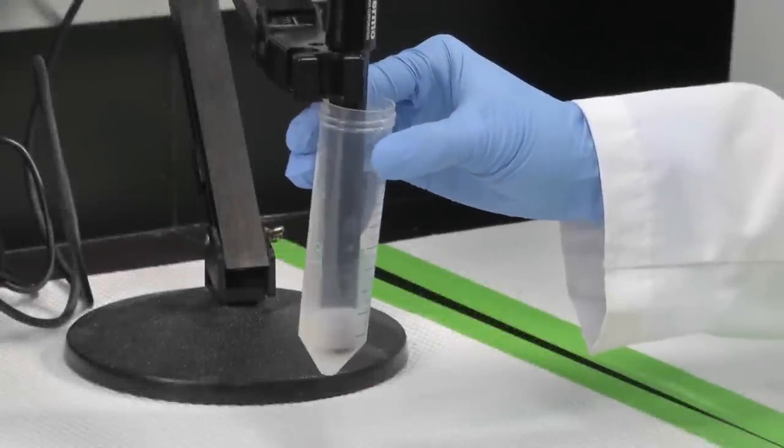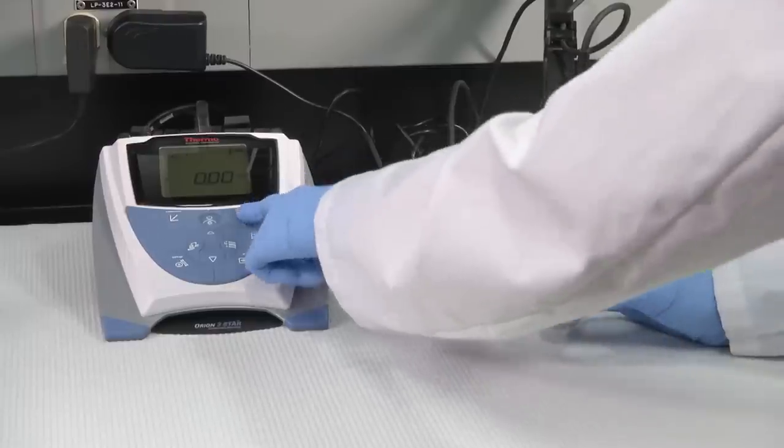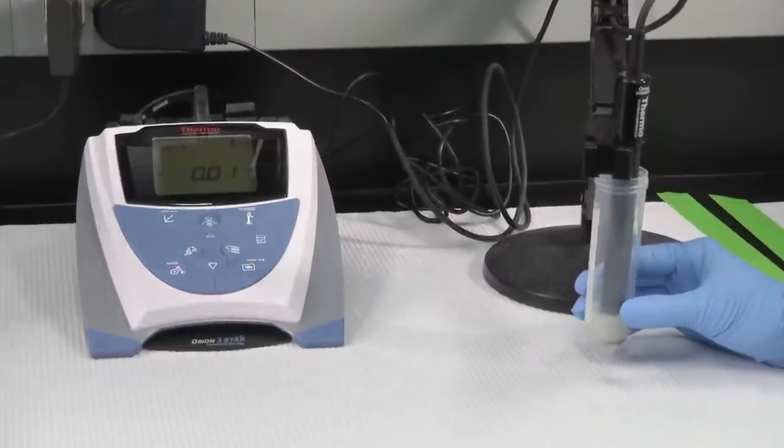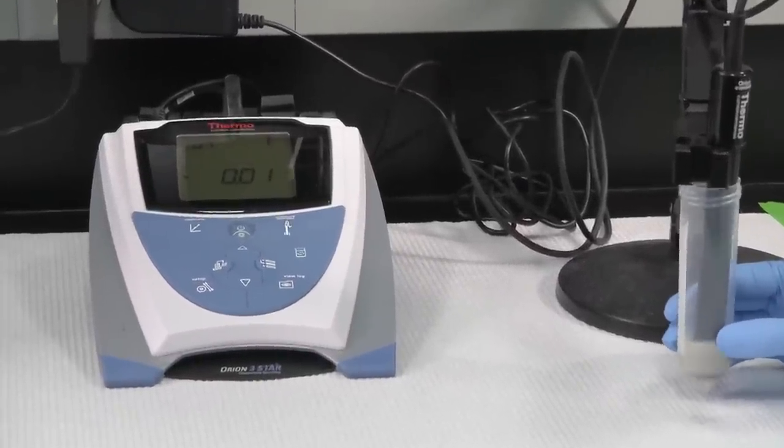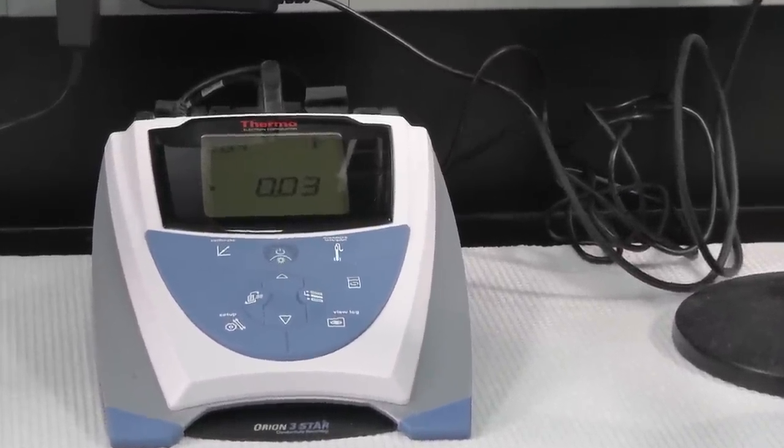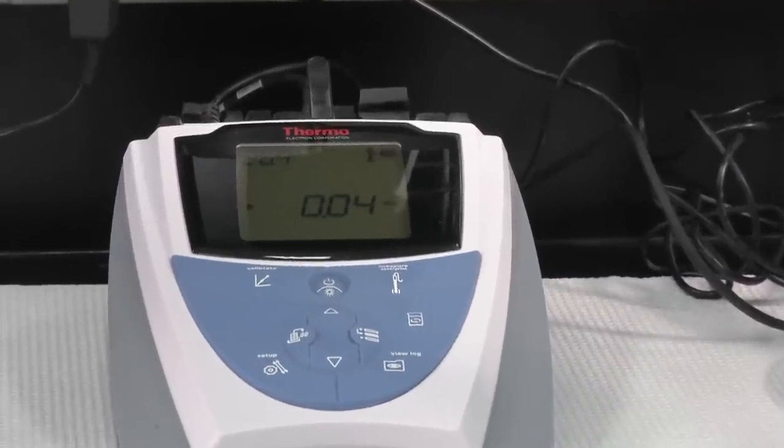Measure the conductivity of the emulsion. The conductivity of the second emulsion was much lower than the first, indicating that a water and oil emulsion was formed rather than an oil and water emulsion.